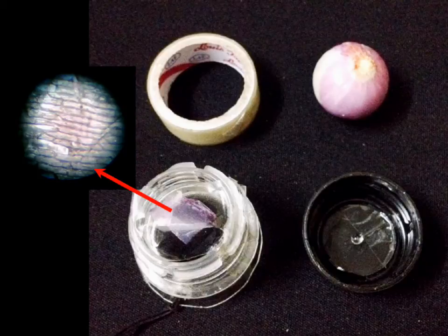For example, we have onion skin. Put it with the sticky tape, press over here, and then you have the lens here. Look against the light and adjust the focus by turning the cap.